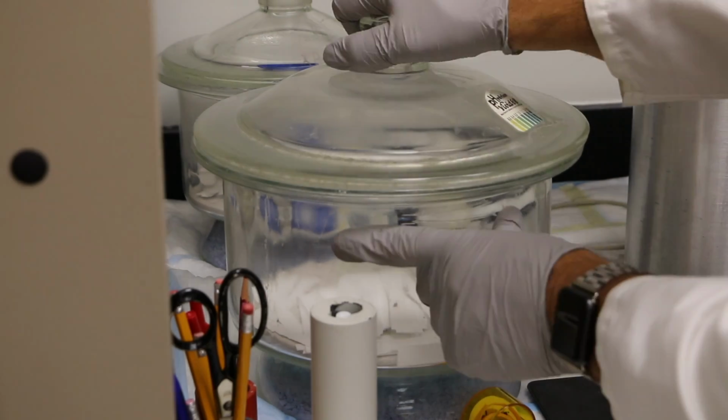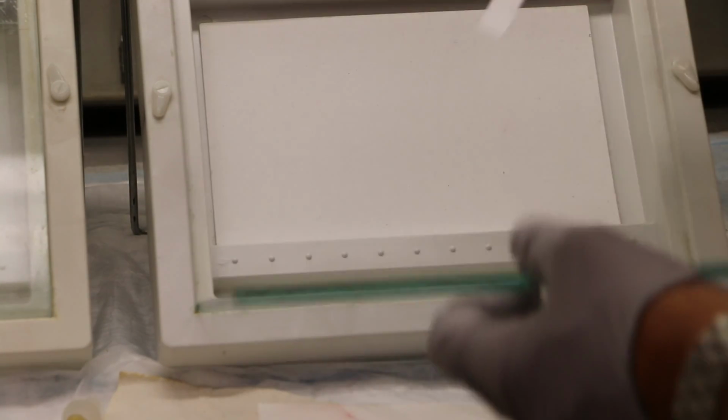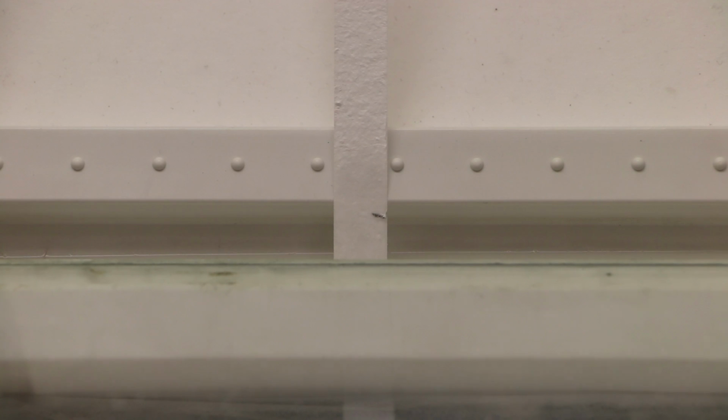Remove the test strip from the container by sliding the lid. Draw a pencil line 1 to 1.5 centimeters from the base of the strip. Using a tuberculin syringe, place a single drop at the level of the pencil mark. Place the strip in the solvent tray with the base of the strip touching the solvent. Observe the solvent moving past the origin point by about 2 centimeters.